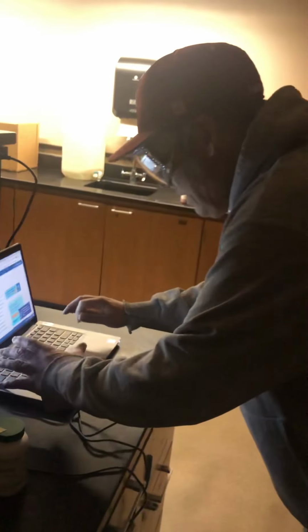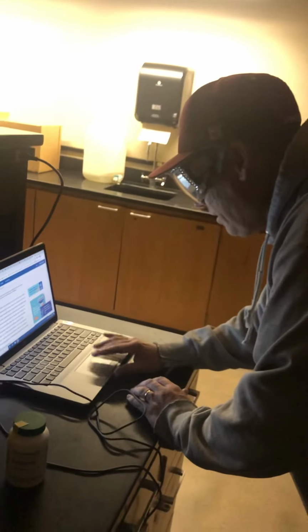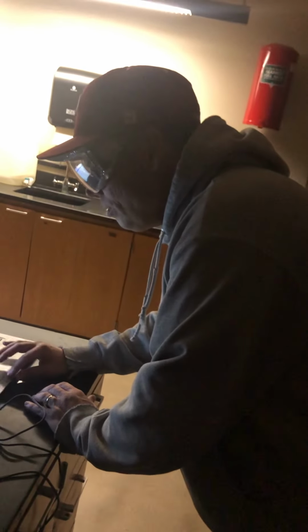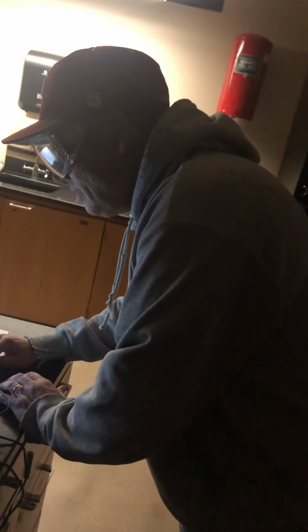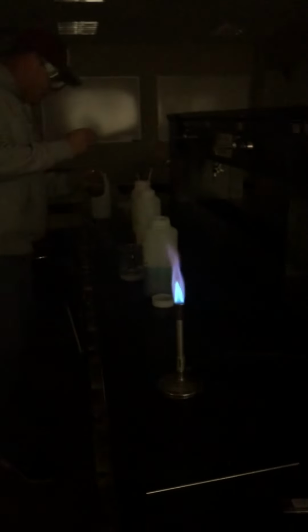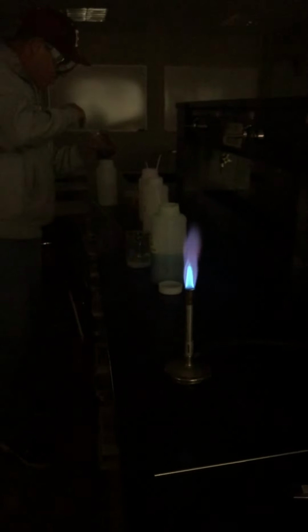And so what we're going to put for that is blue. So let's try that again. Okay? We've been having trouble with our iron. So let me get it in there. Now, let's try again. Make sure my inoculating loop is in. I'm trying a new inoculating loop.